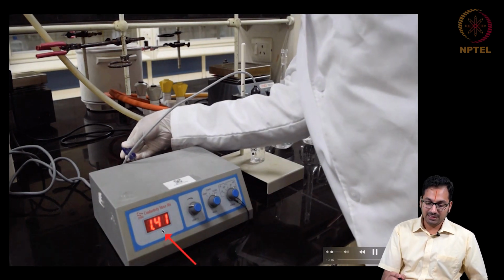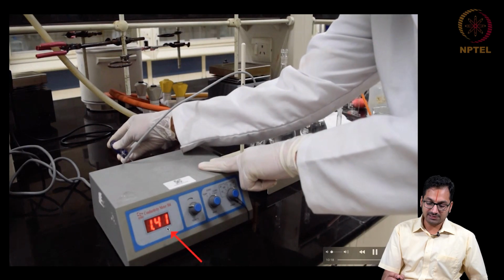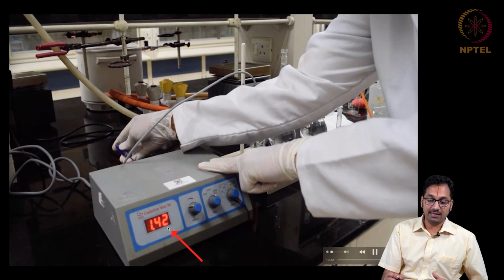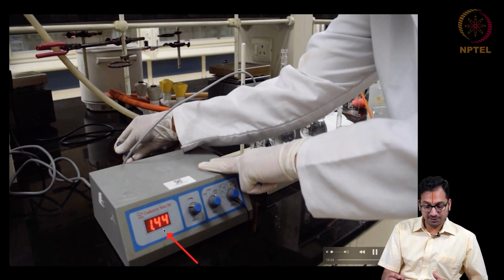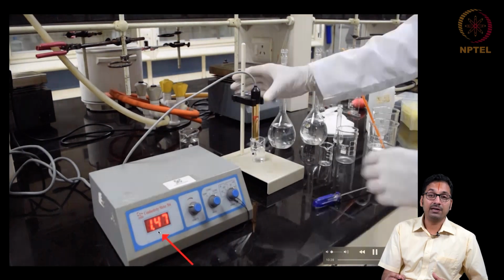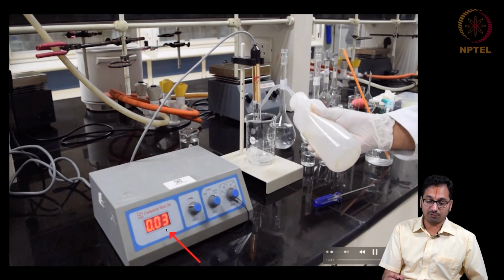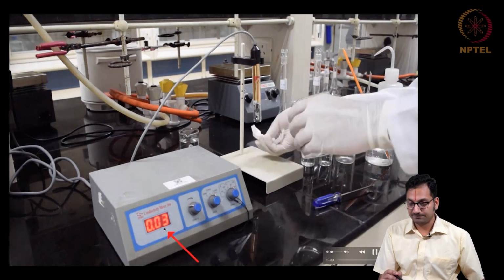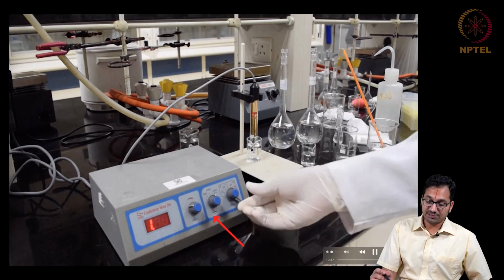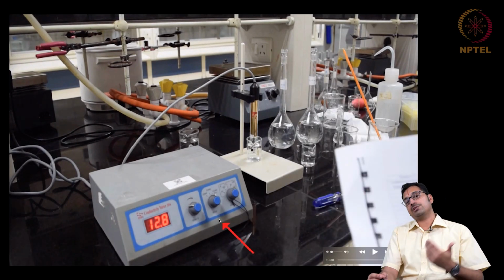You will soon see that the researcher will carefully change this in order to match with the tables that he has obtained. So at that concentration of KCl, the value is set to that of the literature value, which in this case is 1.47 microsiemens, rather 1.47 millisiemens.